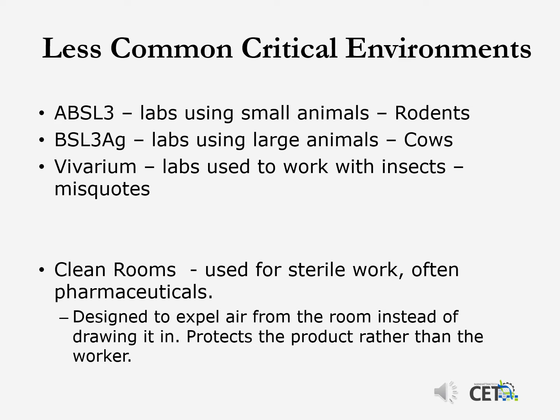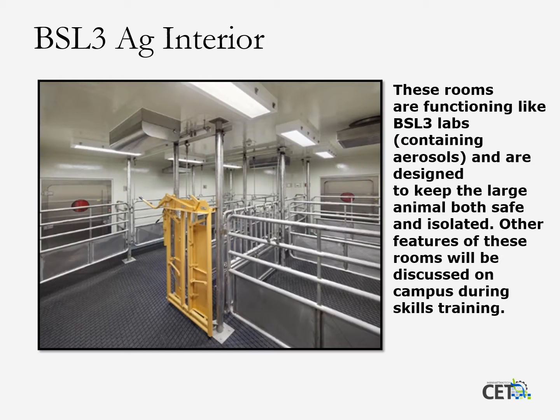That's the exact opposite of a BSL-3. In a BSL-3, the air moves into the room, keeping the contamination in the room. In clean rooms, air moves out of the room, keeping the room sterile.